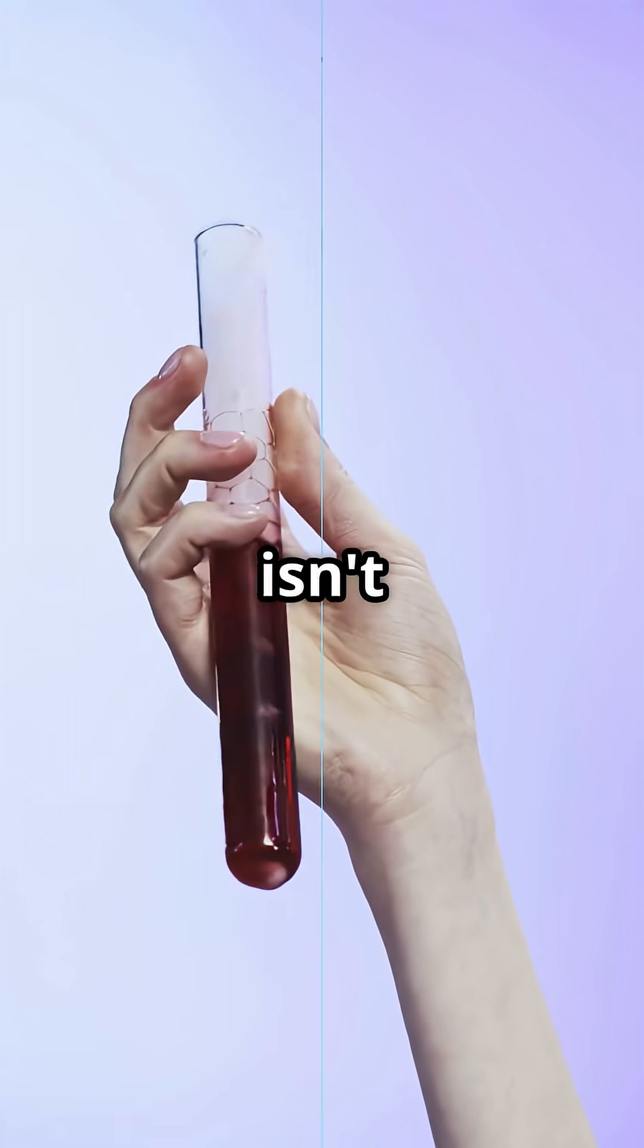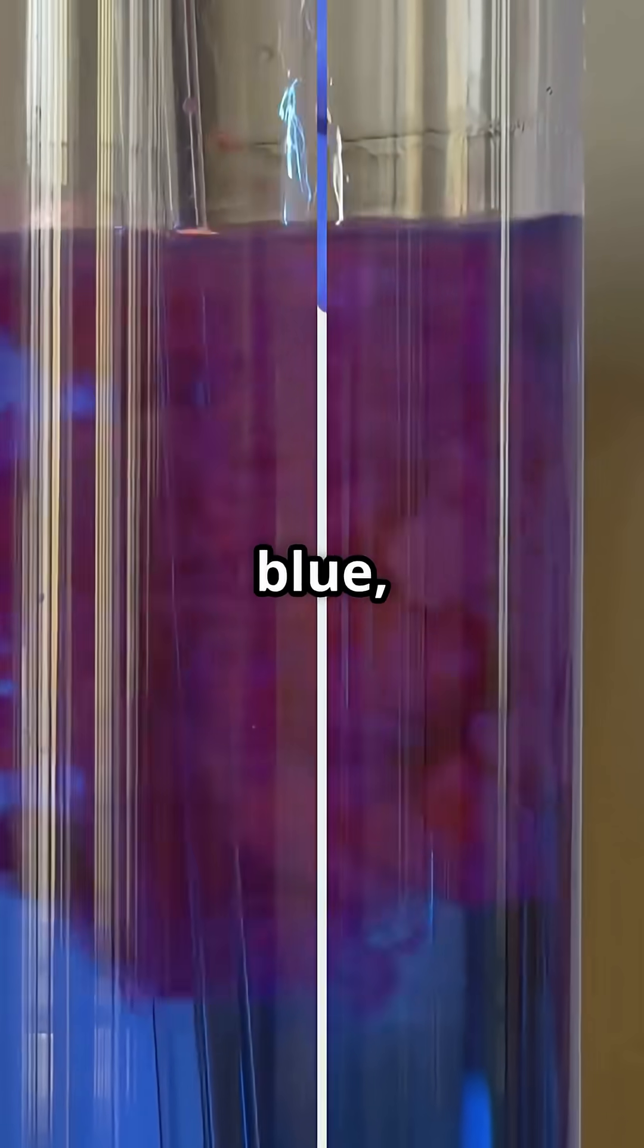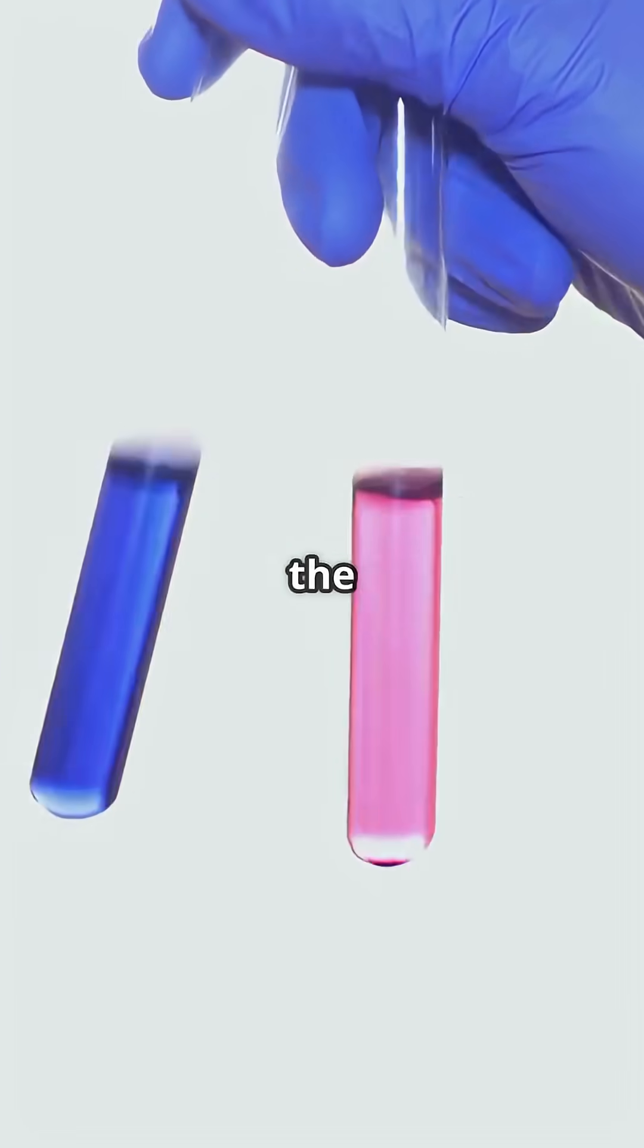But wait, red litmus isn't left out. Splash on a basic substance like soapy water and watch it turn blue, like it suddenly joined the cool club.